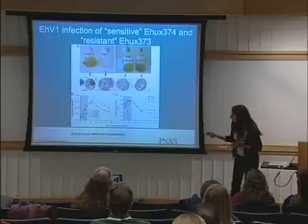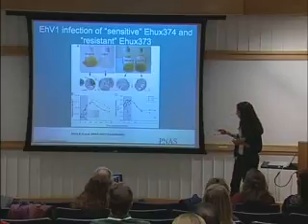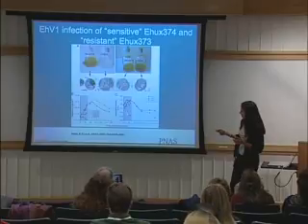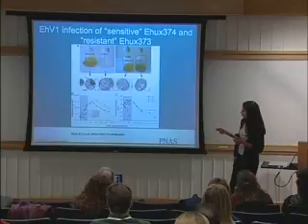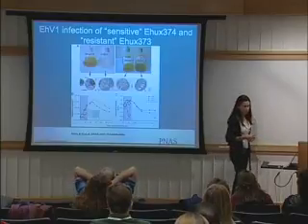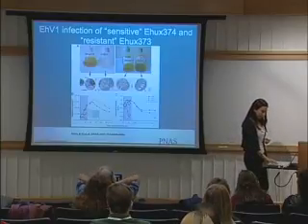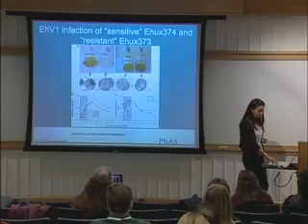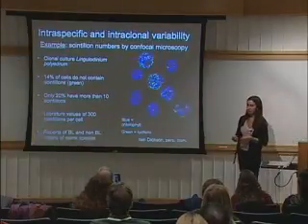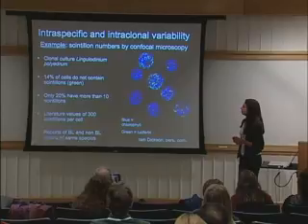And here you can see the abundance of cells, and here you can see the Fv/Fm of the cells. So you can see that the 374, which is this strain here, drops after just a few hours of infection. The photosynthetic efficiency of the cells is basically lysed after a few hours. So this is really interesting if you are interested in genetic diversity and species diversity in general.